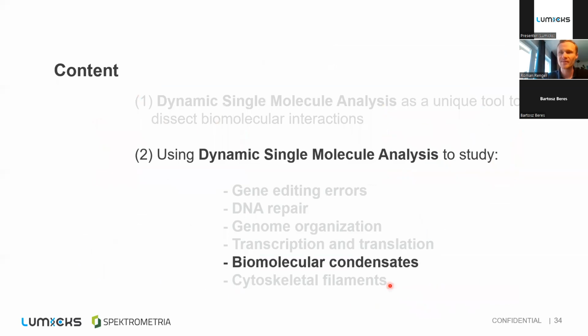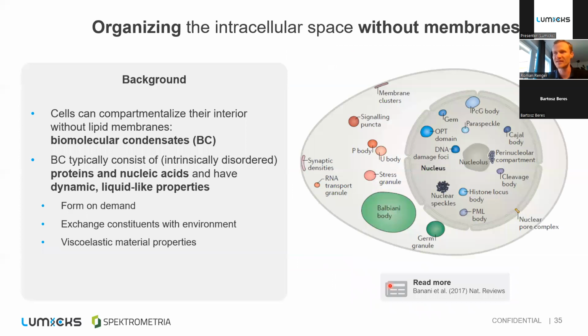The next area of applications I would like to talk about is biomolecular condensates, which is a more and more popular field in biology. Maybe a little bit regarding the background. Cells have been found to be able to compartmentalize their interior even without lipid membranes by forming so-called biomolecular condensates. And they very often consist of intrinsically disordered proteins and nucleic acids.